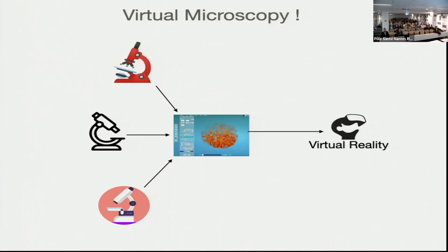And so for that, the main idea is that as a user, you just directly go upload your data on the browser and be able to load them with a virtual reality headset. Not necessarily upload the data. You will be able to just load it on your computer, without uploading anything on our server, and you will be directly able to visualize your just acquired data. Maybe it will take a couple of minutes, but that's the idea.